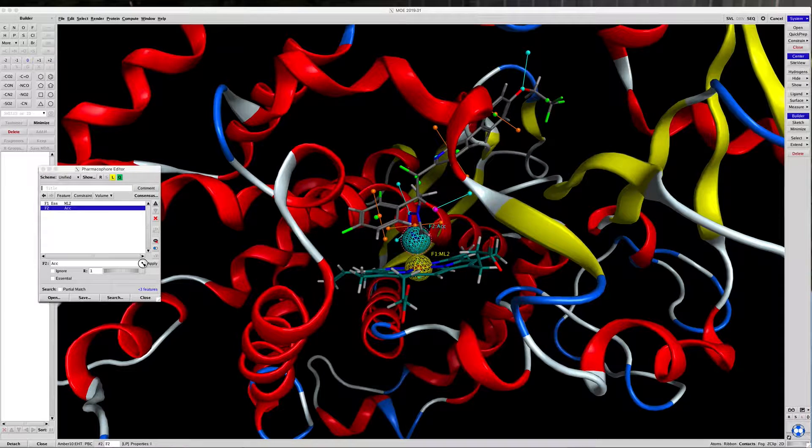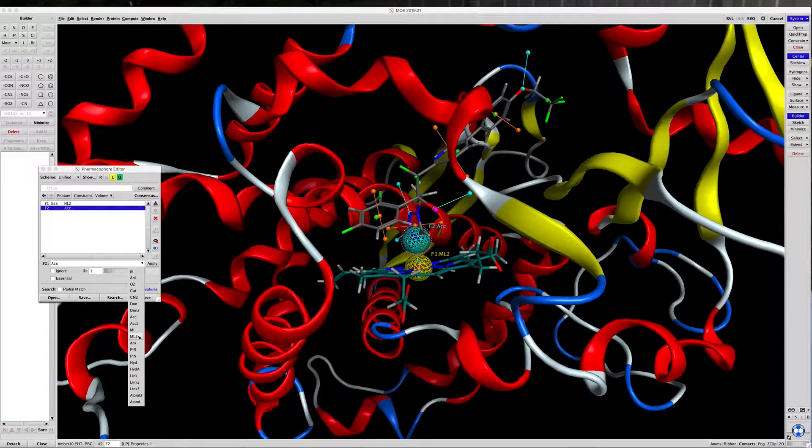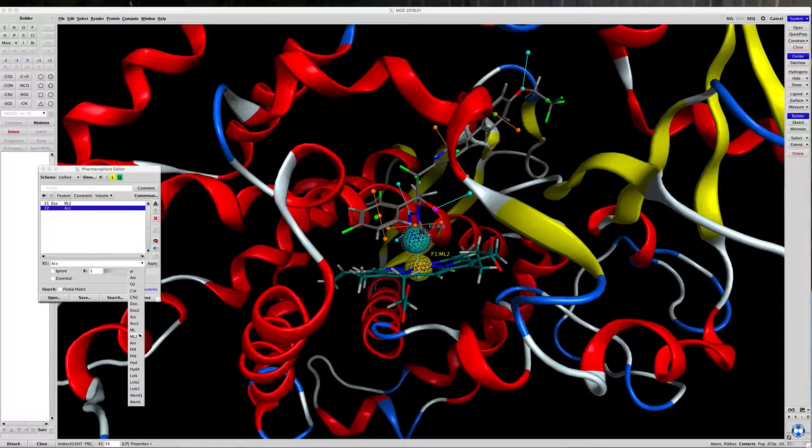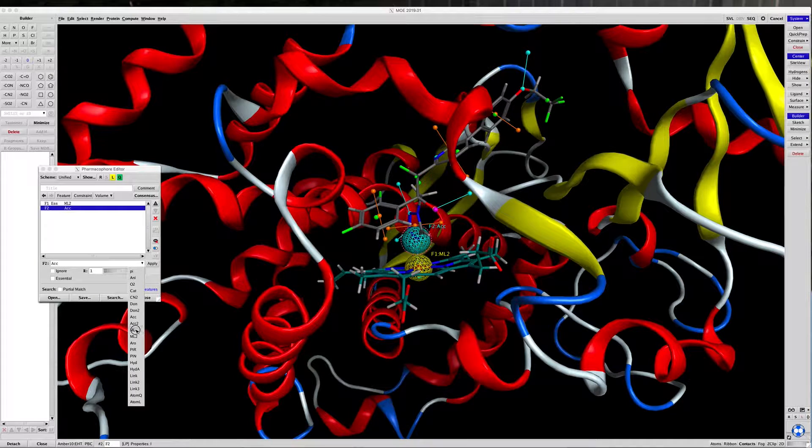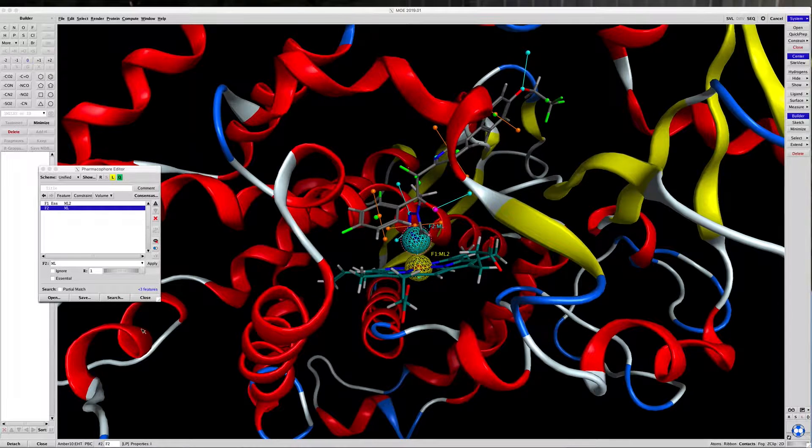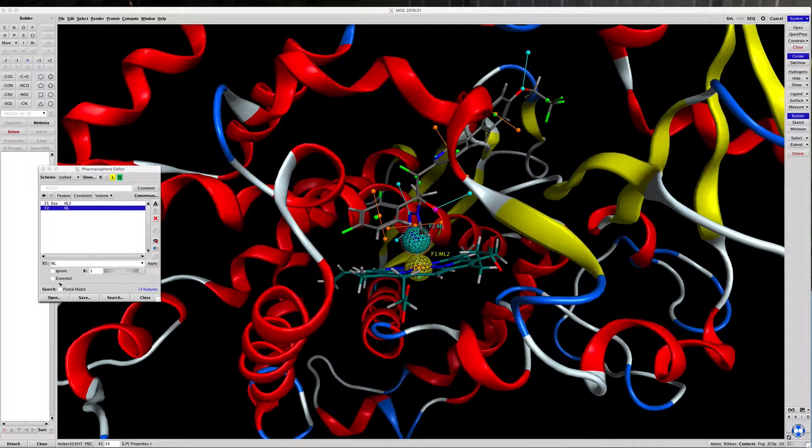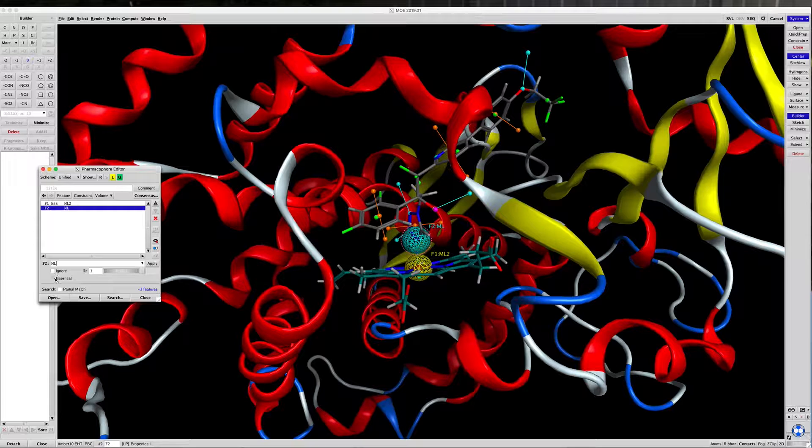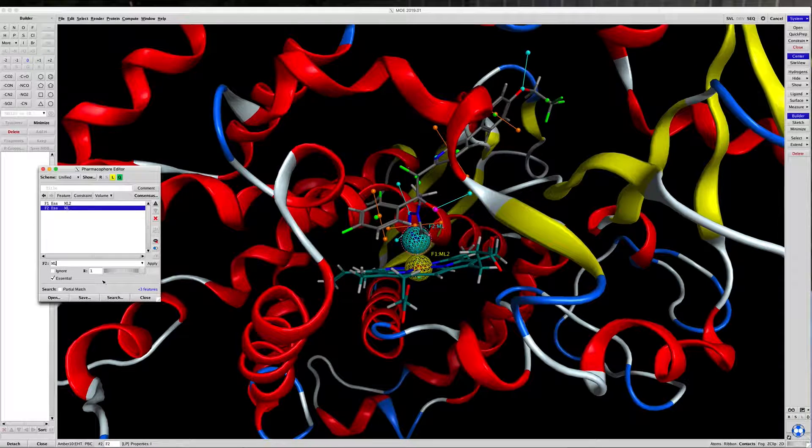Under the F2, to tell the software what this is, we'll call it ML. What that is, is metal ligator. It's going to be an essential part of the pharmacophore.